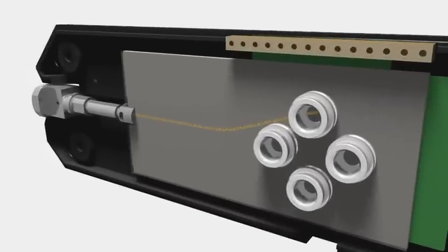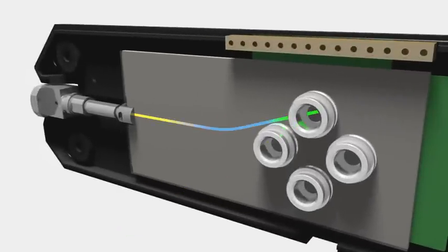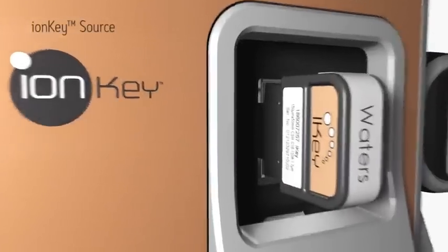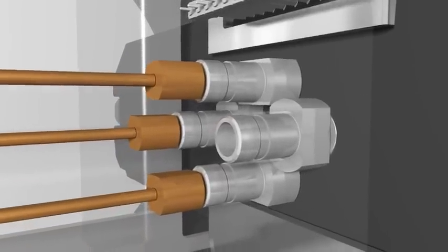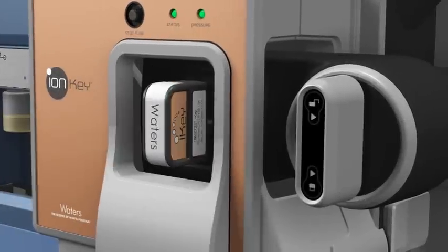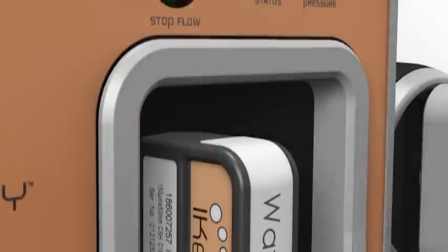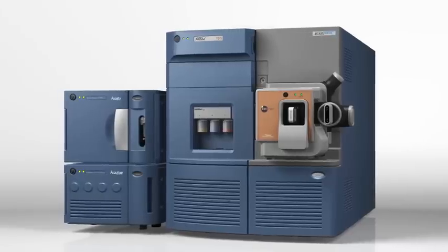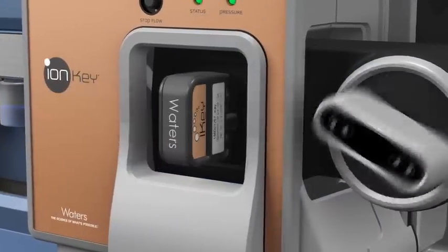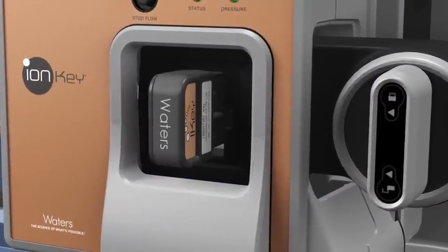The iKey contains the chemistry and e-cord to perform robust, reproducible and reliable UPLC separations. Inserting the iKey simultaneously engages both electronic and fluidic connections. By simplifying the user experience, this enables users of almost any skill level to operate the system, and easily switch from one iKey to another without making adjustments.